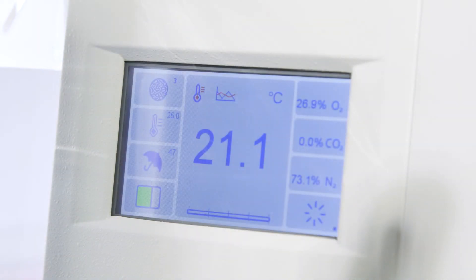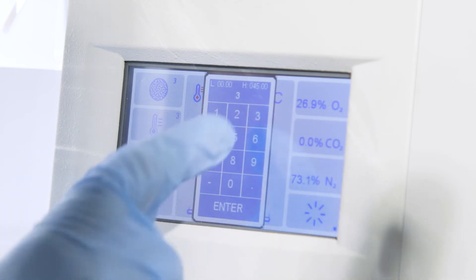The H25 is fitted with a full color touch screen providing the user with an intuitive interface to control and operate the workstation.